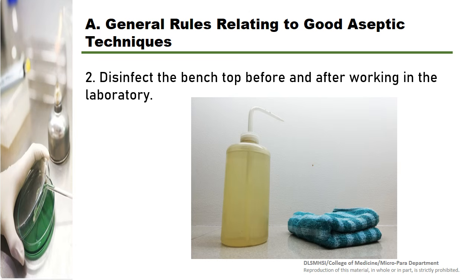Disinfect the bench top before and after working in the laboratory. Commonly used disinfectants are 10% bleach or sodium hypochlorite and ethanol. These are recommended because of their rapid action that usually takes around 5 minutes contact time.